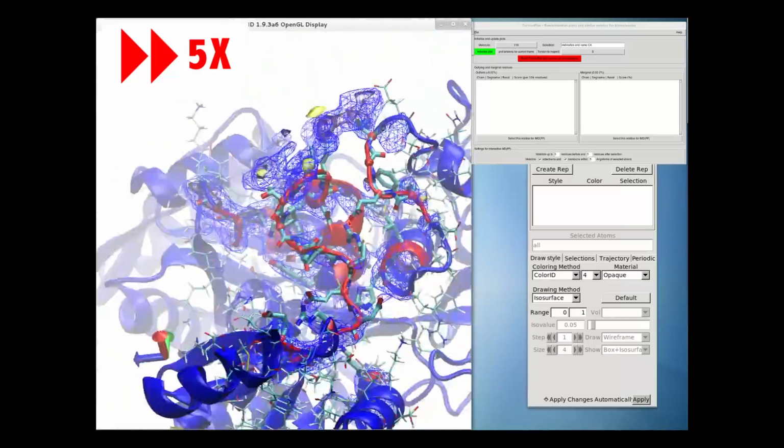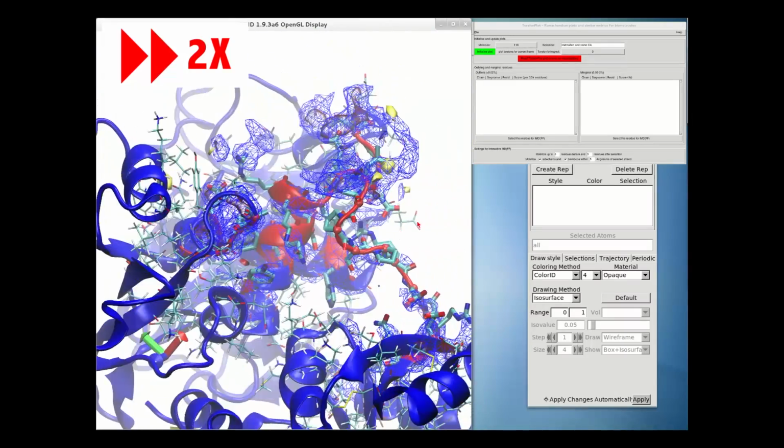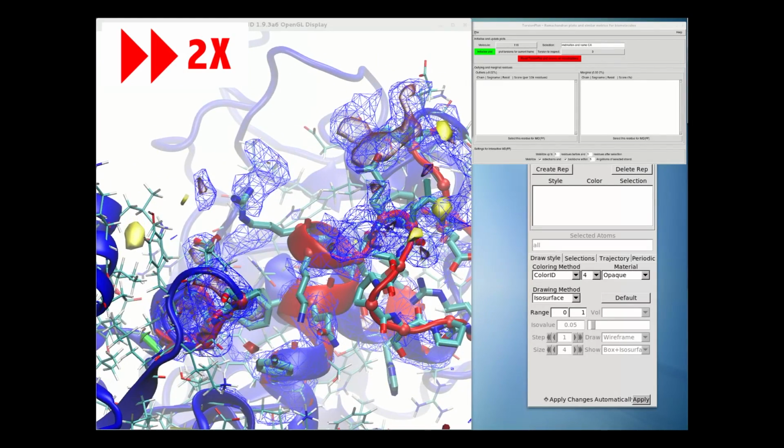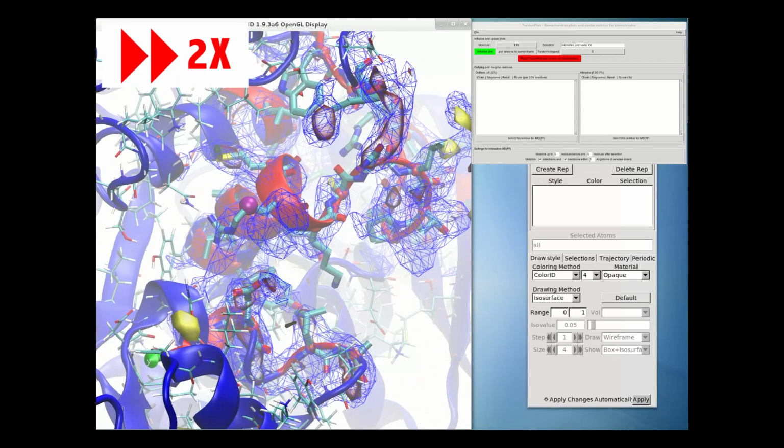Here's a good opportunity to demonstrate one of my newer features. If we pause the simulation, we can access a rotamer library whose behavior at first glance looks identical to that of any other package. The key difference here is that this is only a preview. The coordinate changes we're making are ignored by the simulation.